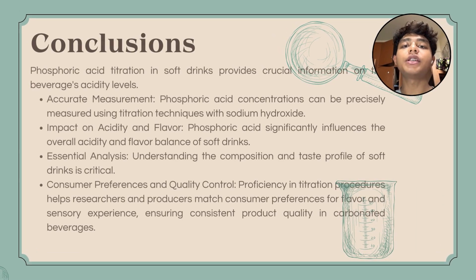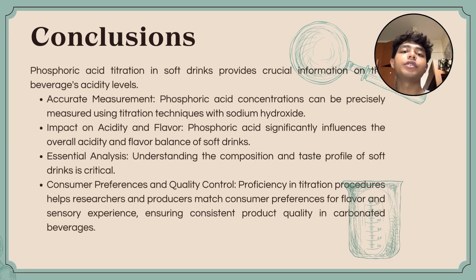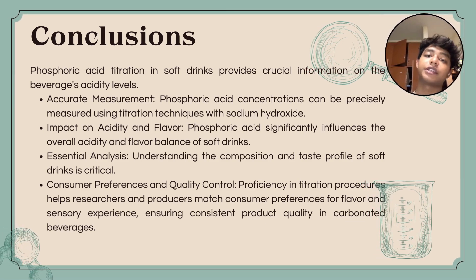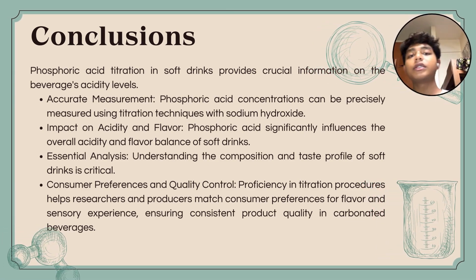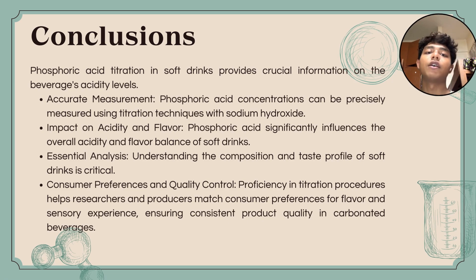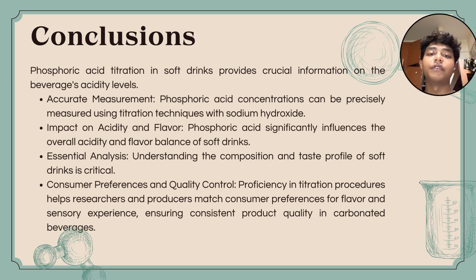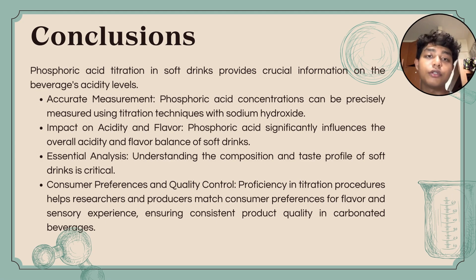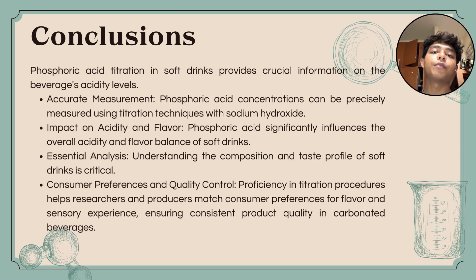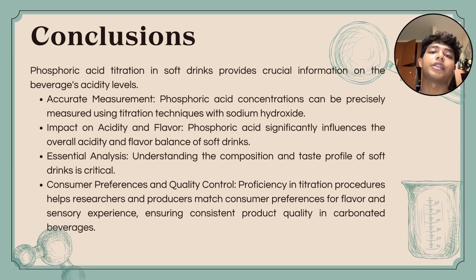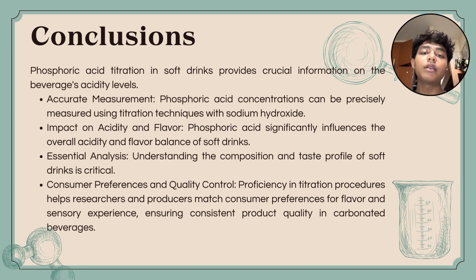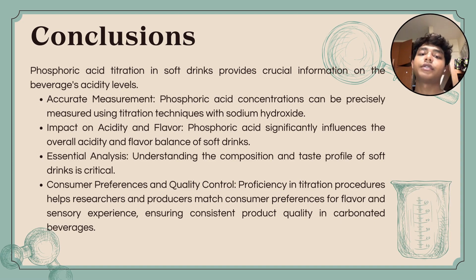In conclusion, phosphoric acid titration in soft drinks offers important information on the acidity levels of the beverage. Phosphoric acid concentration can be precisely measured using titration techniques with sodium hydroxide. Since phosphoric acid greatly influences the overall acidity and flavor balance of soft drinks, this analysis is essential to understanding their composition and taste profile. By mastering these titration procedures, researchers and producers can match consumer preferences and guarantee consistent product quality in carbonated beverages.